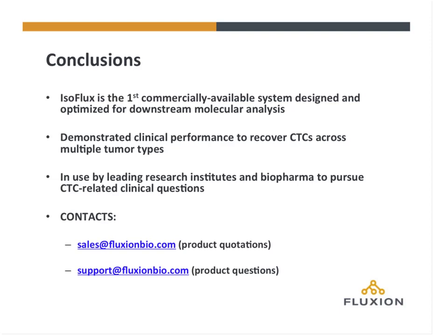But there are other nuances here that have a rationale in physics to explain why it increases the capture efficiency. One is the magnetic moment created by the beads that are attached onto the cell. One key difference that I didn't mention is that we use larger magnetic beads, about 4 microns in diameter, whereas CellSearch uses a ferrofluid which has nanometer scale particles. What that means is that we've characterized our system such that if you have just one bead attached to the cell, we can capture it on our platform.